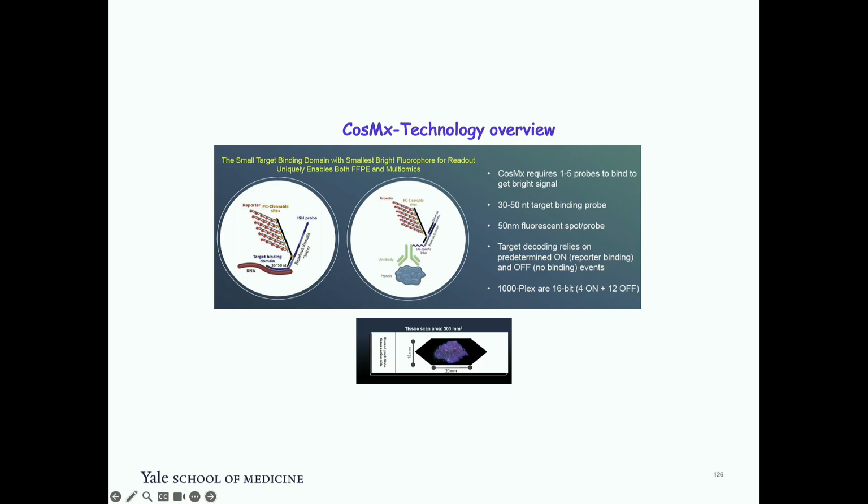Every PCR cycle adds one extra fluor. That is how you increase the concentration of fluor, and you do this in a combinatorial manner. You have multiple probes for each gene, say 5 probes for each gene, but you do not add all 5 probes in each cycle. Each cycle you have a set of probes for a set of genes, and you hybridize, do the amplification, take a picture, wash it off or quench it, and then come back and add the next round.